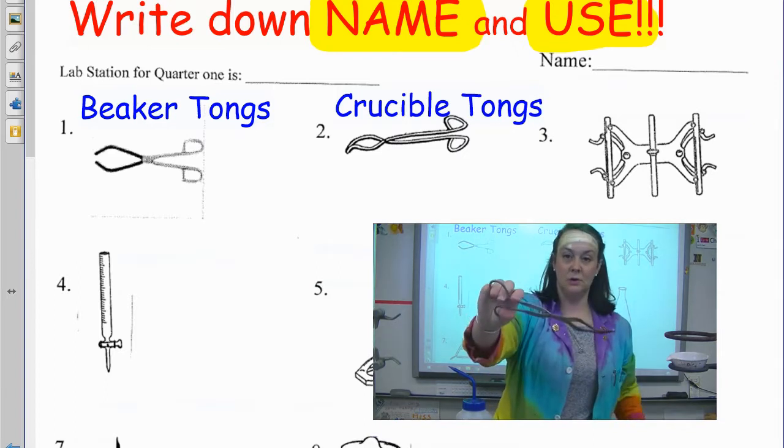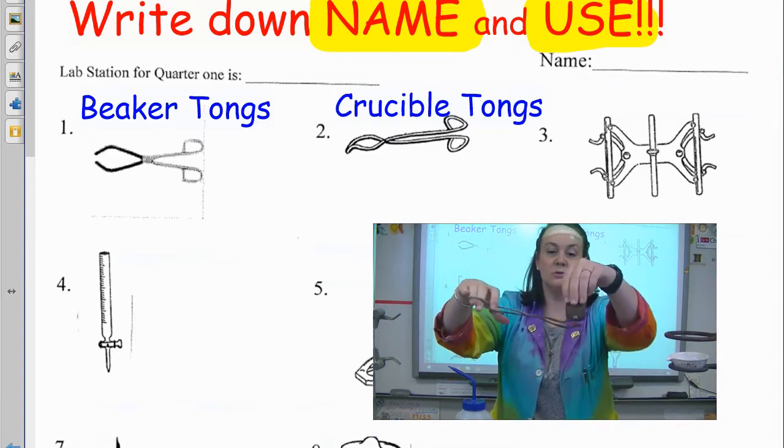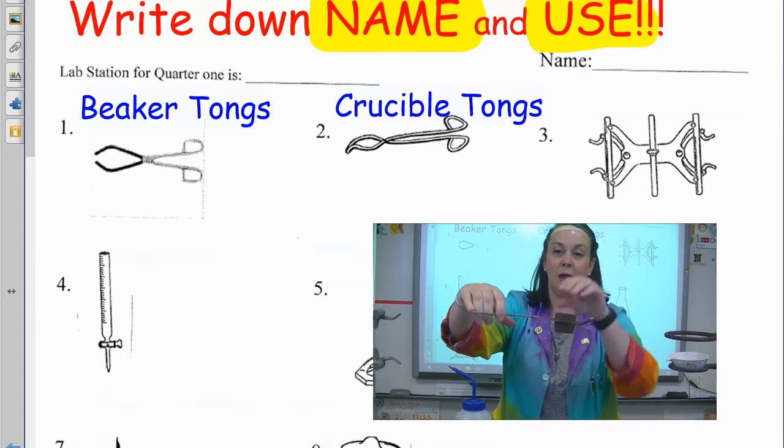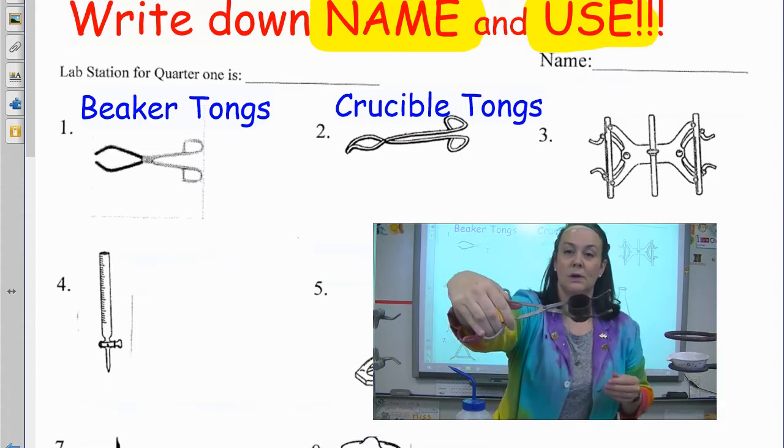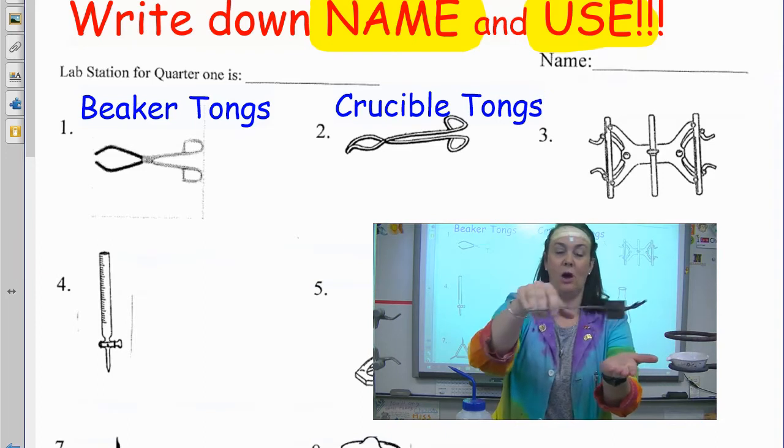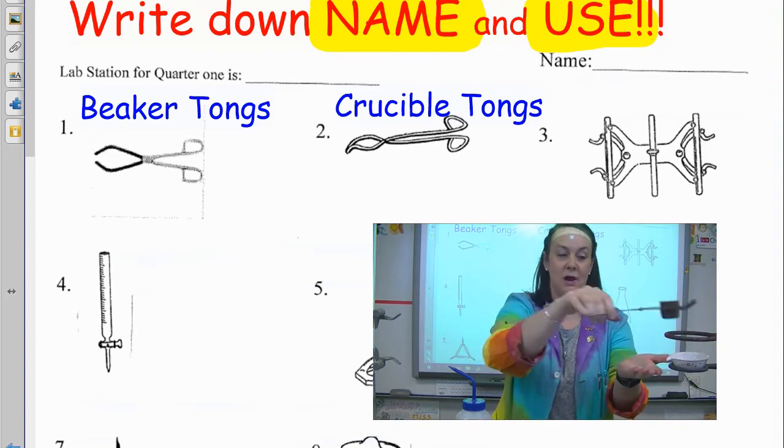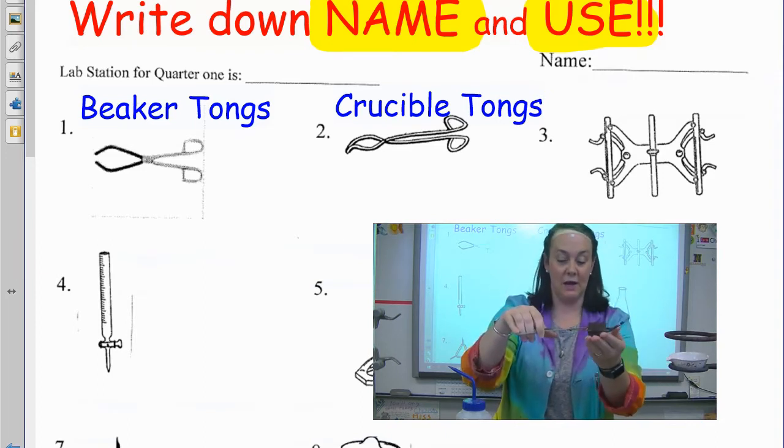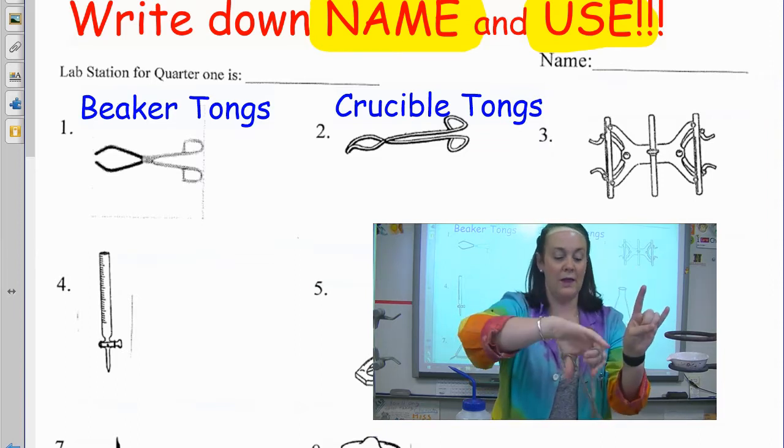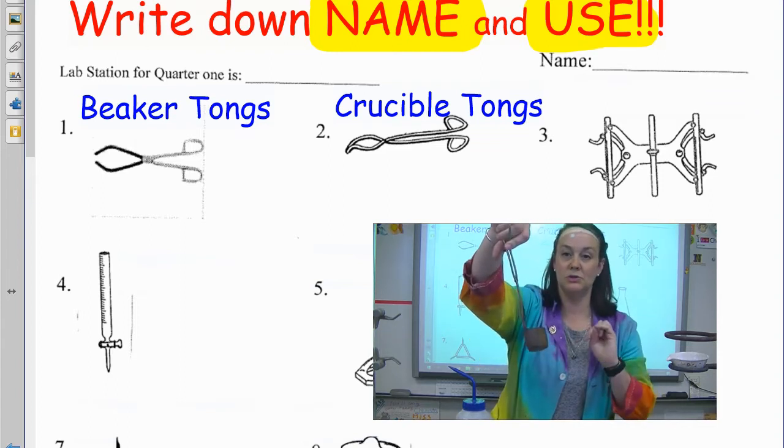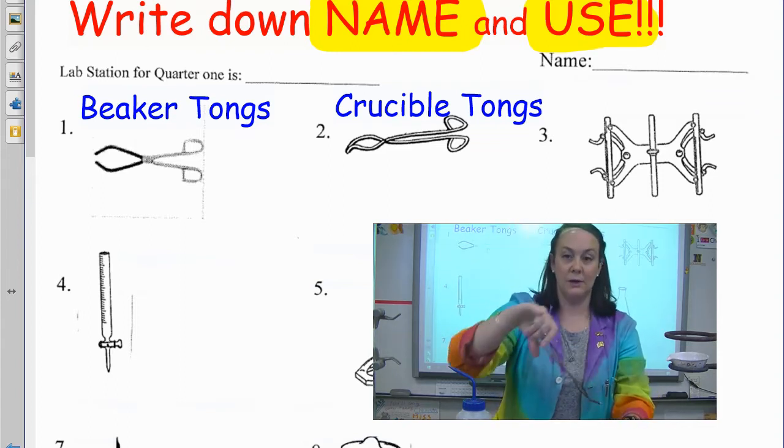And what crucibles can do, crucibles will do, is crucible tongs, excuse me, they hold hot crucibles. So again, if you're taking a crucible off of the hot standard apparatus, you have a way to take it. The way that you remember to use crucible tongs is you always hook the little horns up. And they also can be used as little pinchers if you need to, to pick things up.